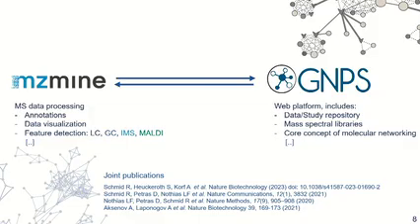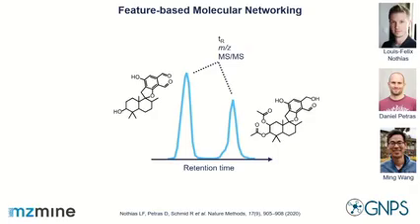We have a data-dependent acquisition, non-target LC-MS data set that we want to analyze and then cluster the chemical space. So we want to see if there are chemicals that are similar in our own data set and then cluster them in a network. This has been popularized for small molecules by the GNPS online platform, and there's a strong collaboration between the two groups, as I've also been visiting Peter's lab, and we've been working on this for a long time. Louis, sadly, cannot be here today, but he's going to be here from tomorrow.